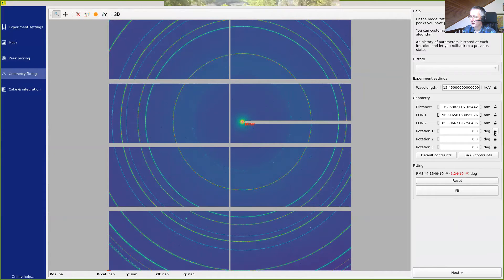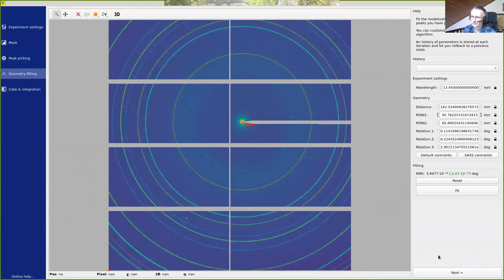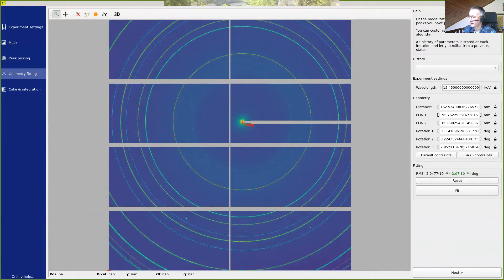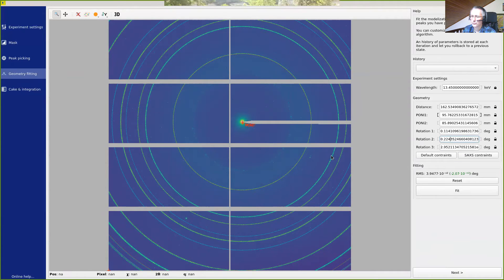And once this is done, we can refine all those parameters. We can now unlock, for example, the tilt and fit again. We can see that the values for the tilt are pretty small, 0.1, 0.2 degrees.